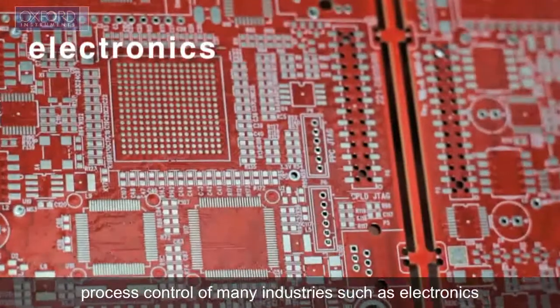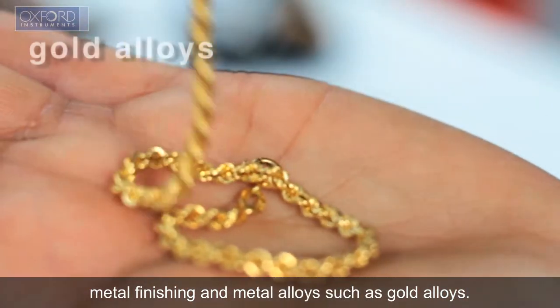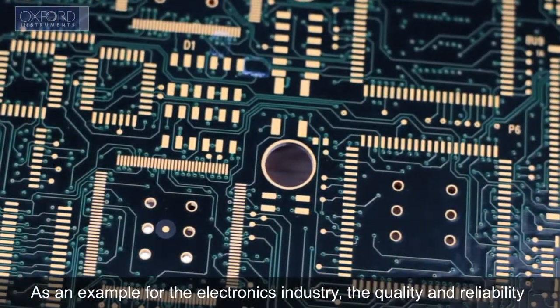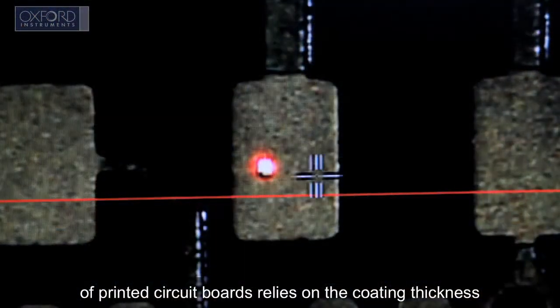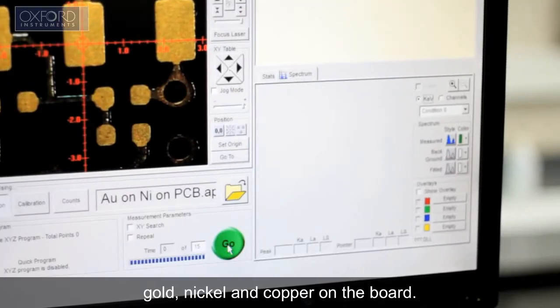Industries served include electronics, metal finishing and metal alloys, such as gold alloys. As an example for the electronics industry, the quality and reliability of printed circuit boards relies on the coating thickness of gold, nickel and copper on the board.